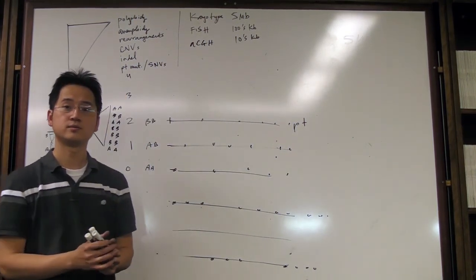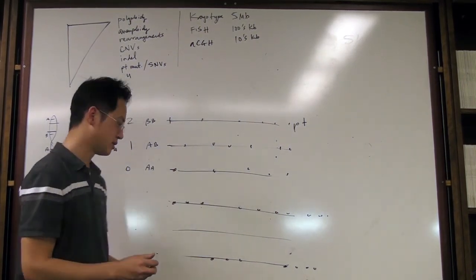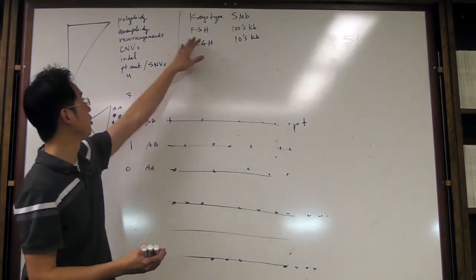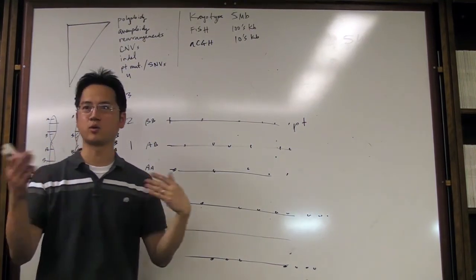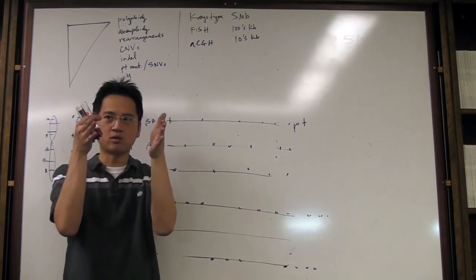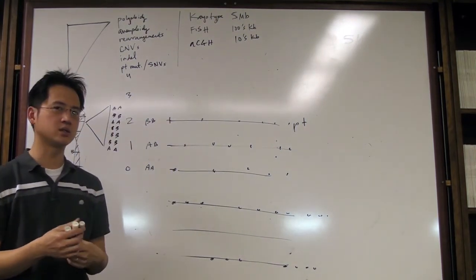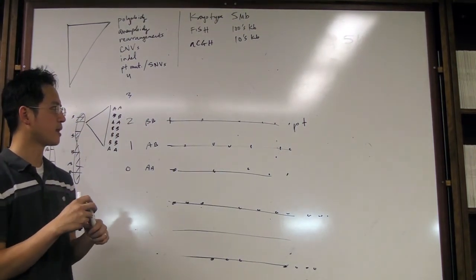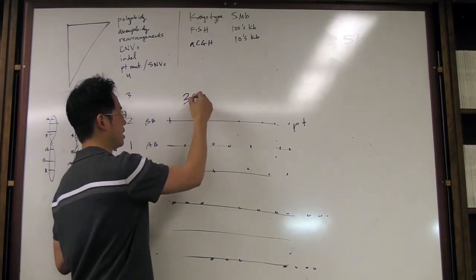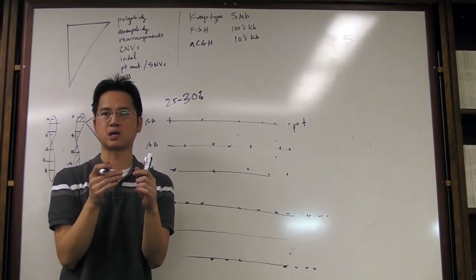Yes, questions? I know that some people are considering using that array also for cancer. Right. So cancer, obviously, would be very crazy. If you've seen any arrays on cancer, you'll get aneuploidy across the genome. Sometimes 10 chromosomes are involved, whole P arms, whole Q arms, smaller deletions, EGFR amplification, easily detected by array. I forgot to mention that there are some sensitivity issues with that. My guess, from what I hear, is that you need roughly 25 to 30% of disease cells, minimum, before you can detect it.